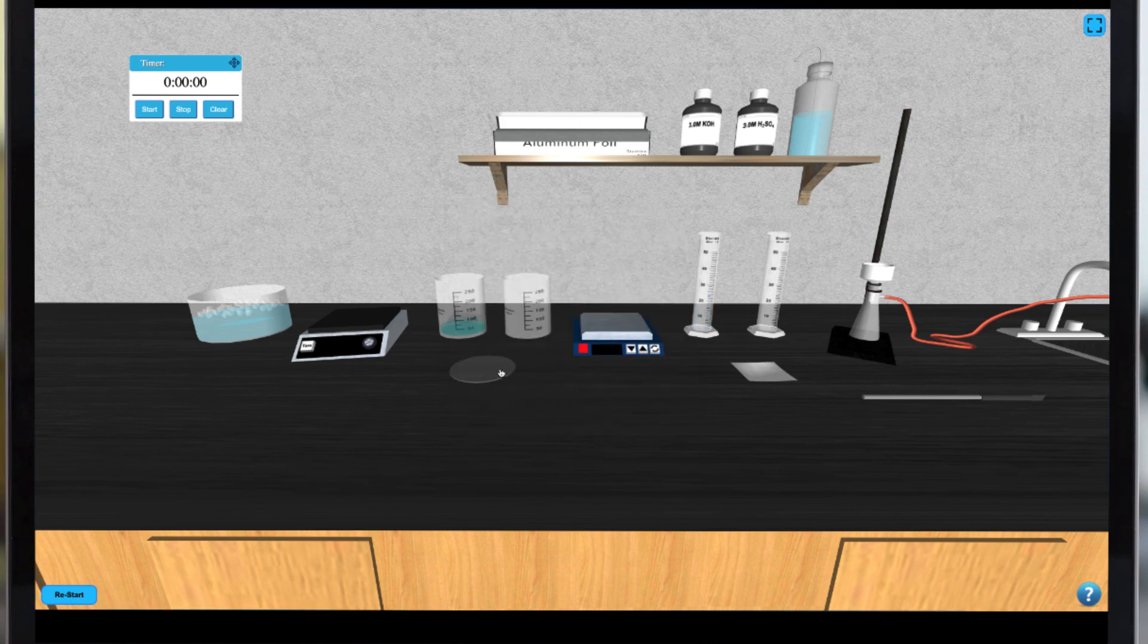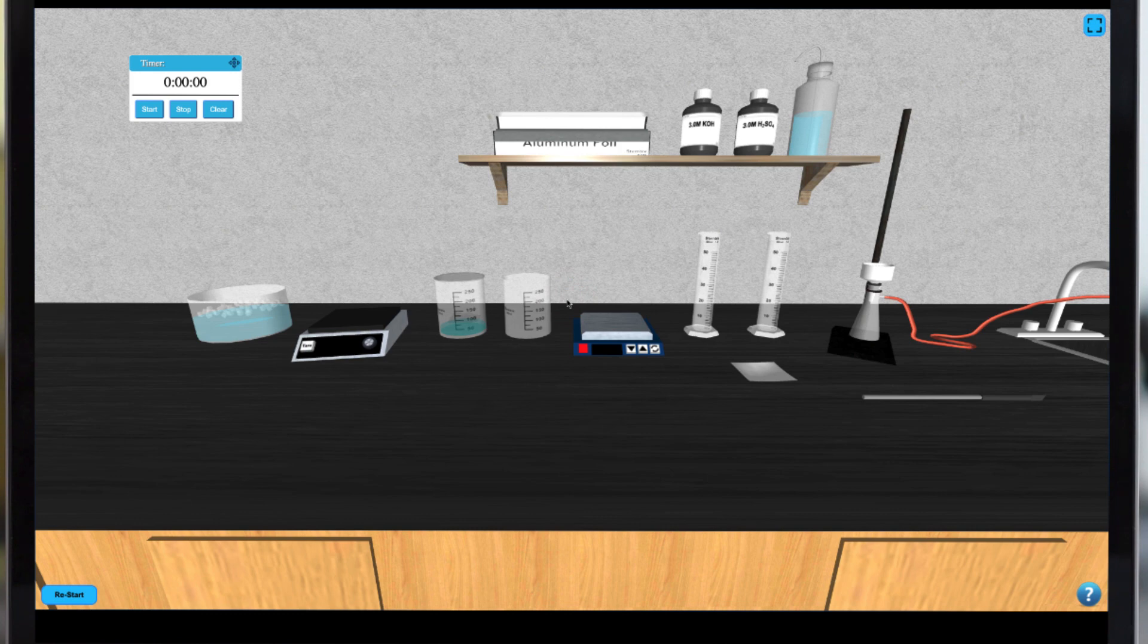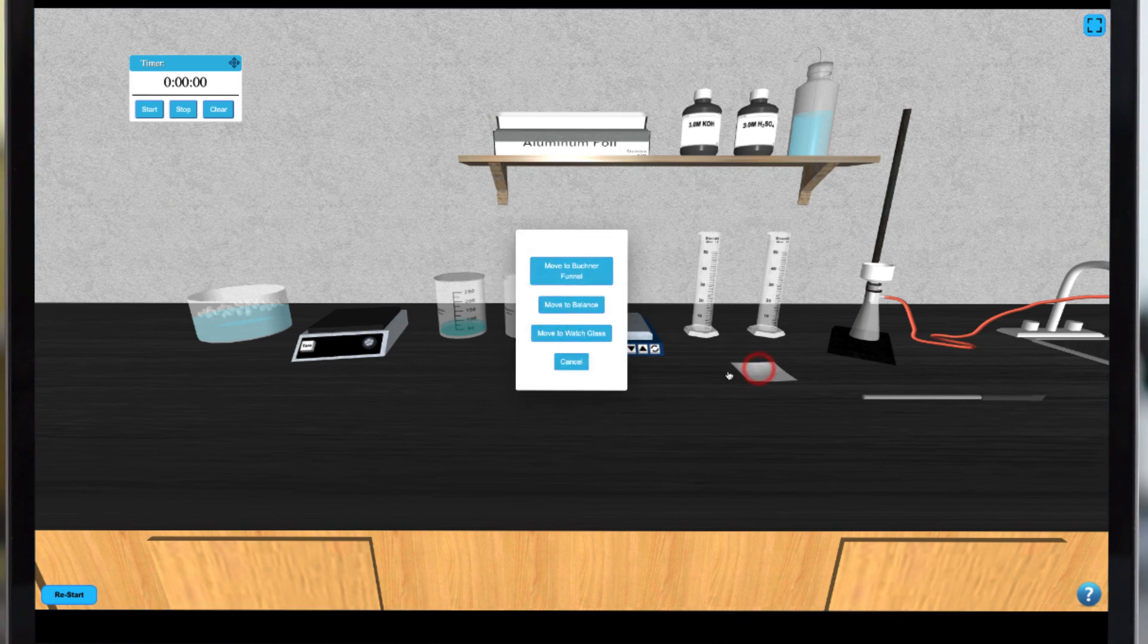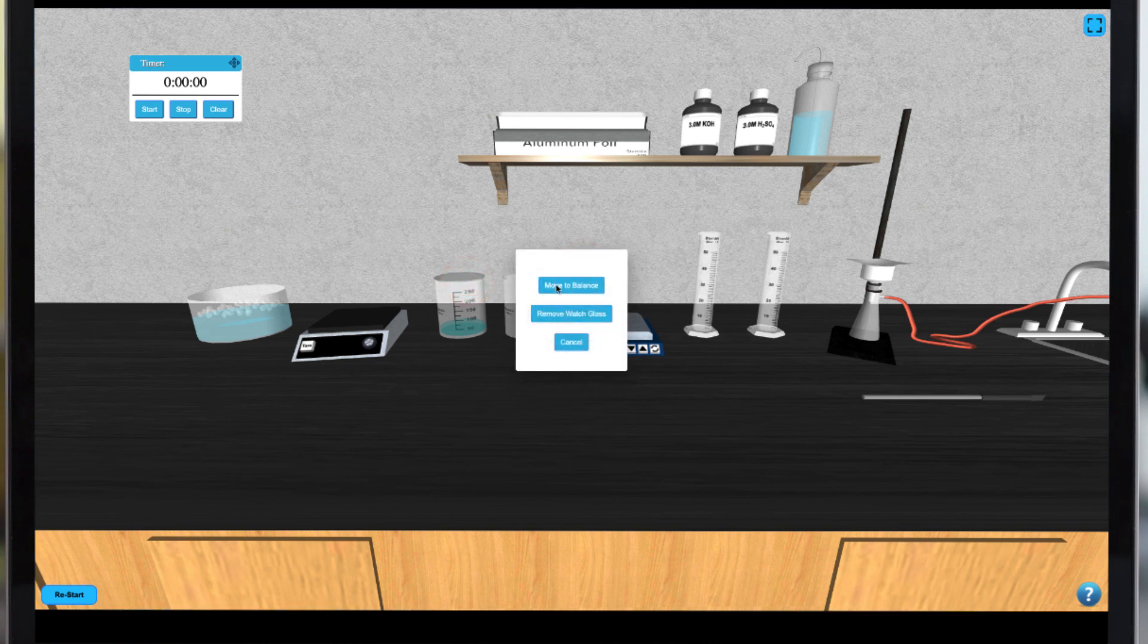Place a watch glass on the beaker by clicking on the watch glass. Once dissolved you can place the filter paper on the Buckner funnel by clicking on it. Then you can remove the watch glass and transfer your beaker contents to the funnel.